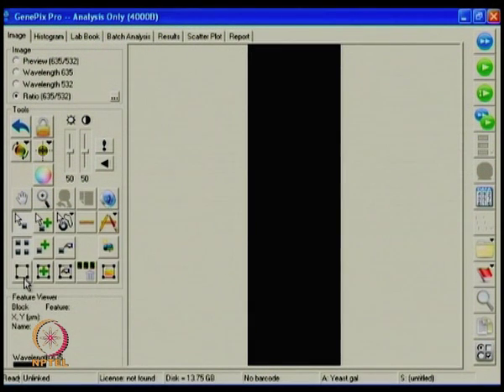So if by chance you don't know, or you are preparing by yourself, these buttons here allow you to make your own blocks and create your own GAL file with the help of the tool called Gene Array List Generator. Okay. So now let's look at the control buttons, which are towards your right side.